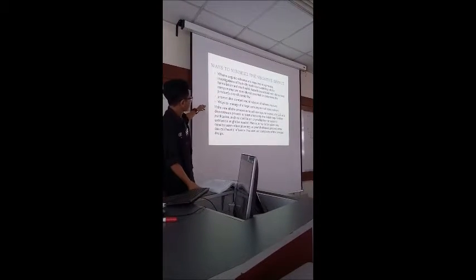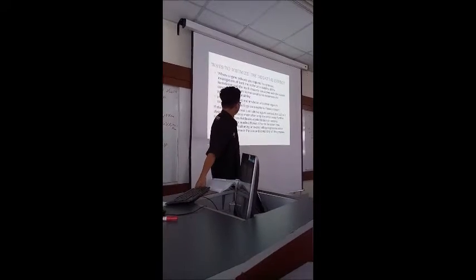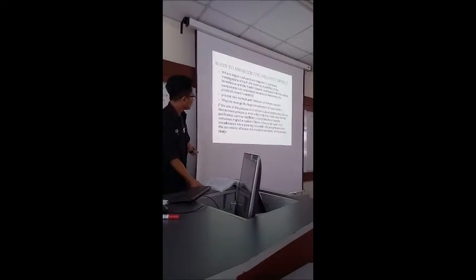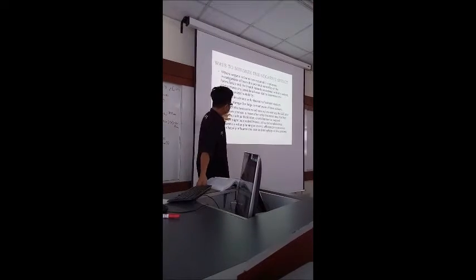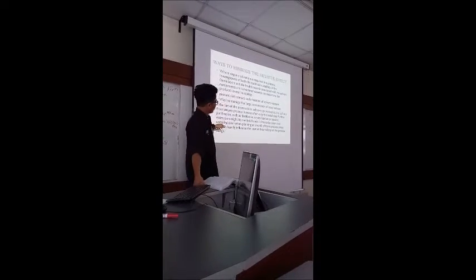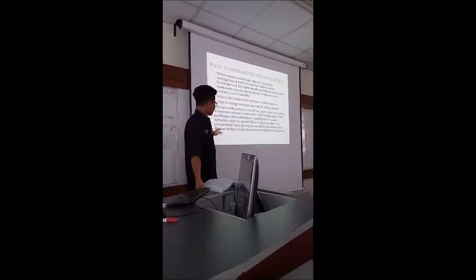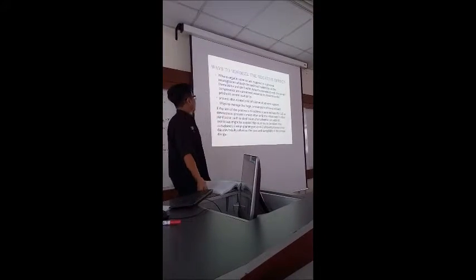And lastly, ways to manage the large consumption of toxic solvent. If the aim of the process is to achieve a pure extract, the LLE as a downstream process is more often only the initial step. Further purification such as distillation, crystallization or a second extraction might be needed. Hence, it has to be taken into consideration when planning an overall efficient process, since this can heavily influence the cost and complexity of the process design.